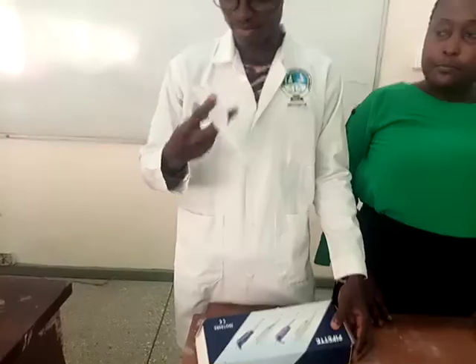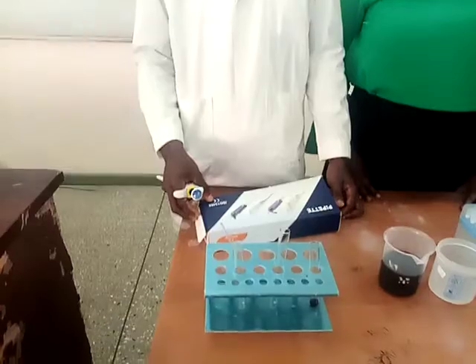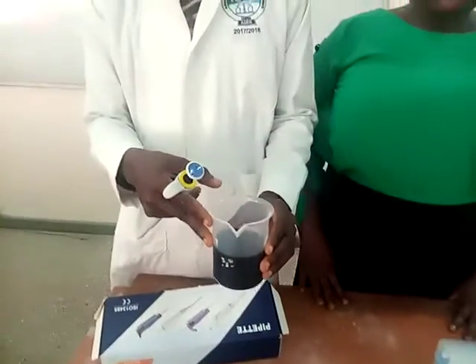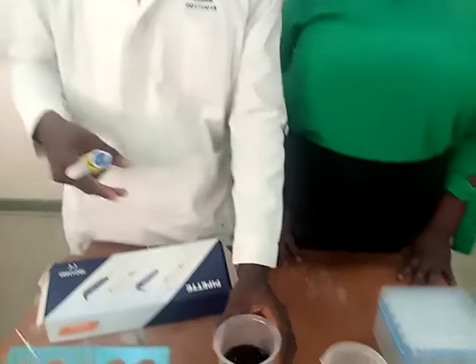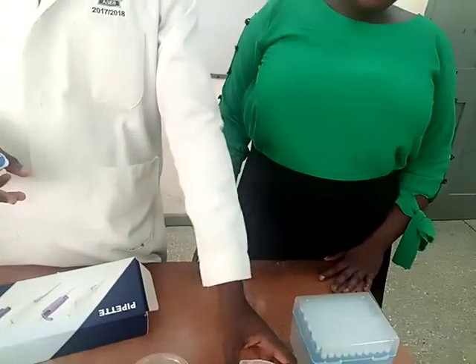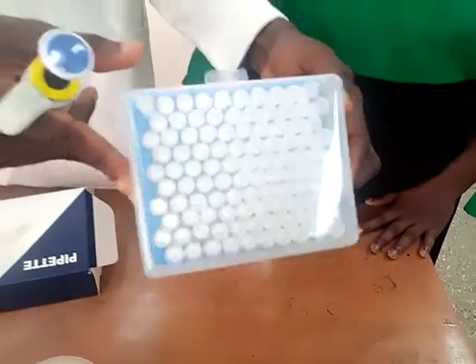Before I start with this lesson, I have my pipet instrument over here with me. This is a P-1000 automatic micropipet. I have my test tubes. I have my beaker with my reagent, which is potassium permanganate solution. I have an empty beaker here where I will eject my micropipet tips in. And I have my micropipet tip box also over here.